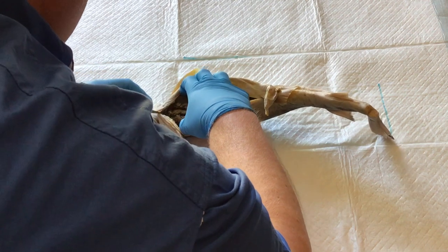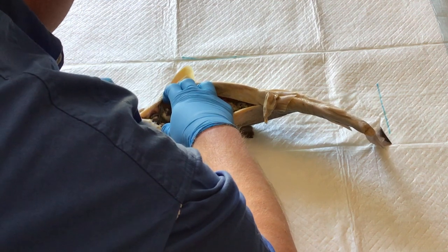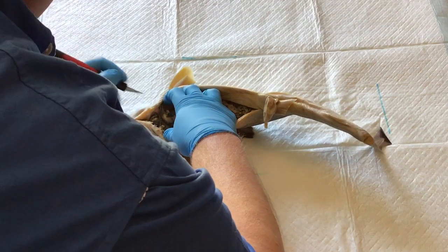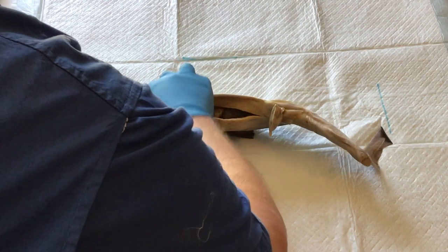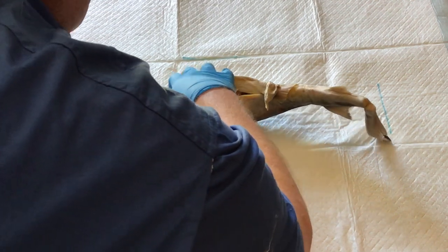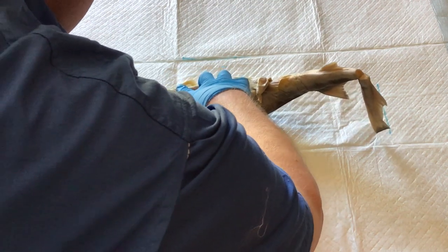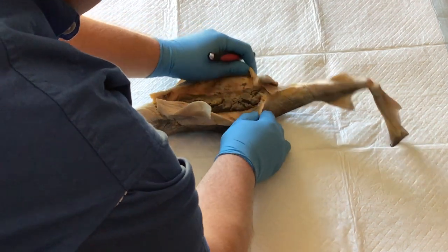Okay, so I'm seeing the inside already. I may take a break here for a second so we can move in a little bit with the screen. I'm sorry my hands are in the way. I'm just trying to get through this thick skin here. And yes, if you are wondering, the smell is horrendous. It smells a little bit like rotting fish. Try to open this up a little bit more so we can see some things.